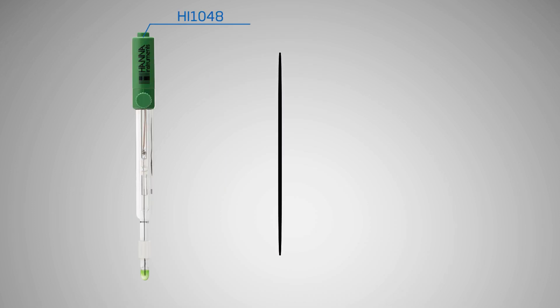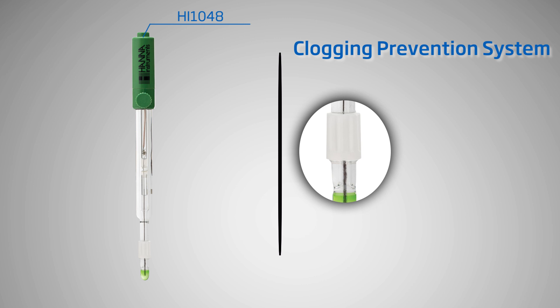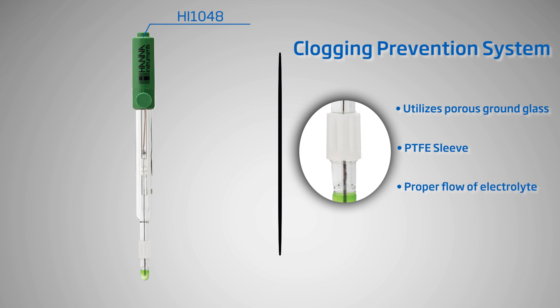The HI1048 is a specialized wine pH electrode. It features HANNA's CPS technology, which prevents clogging of the reference junction. By design, the HI1048 pH electrode utilizes a ground glass PTFE sleeve junction, which controls the steady, predictable flow of electrolyte solution into your sample.